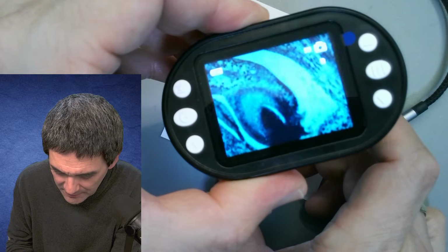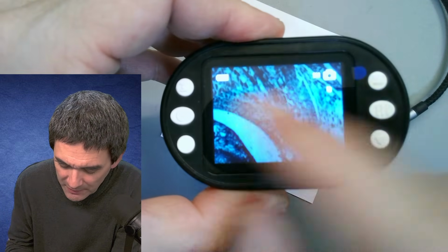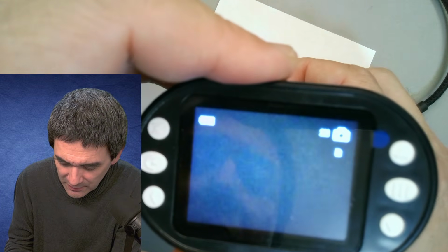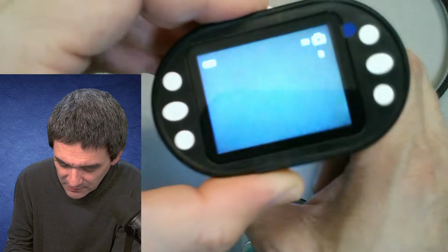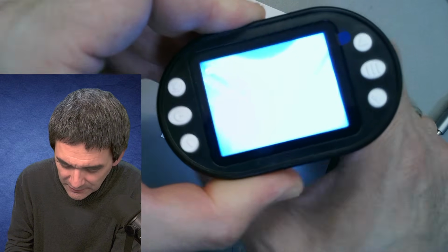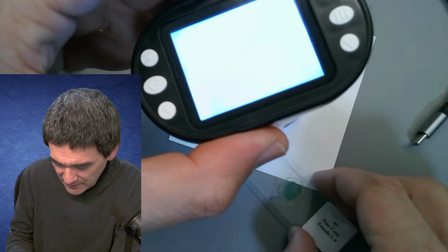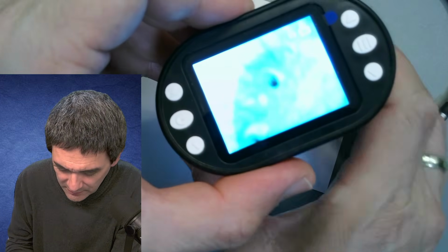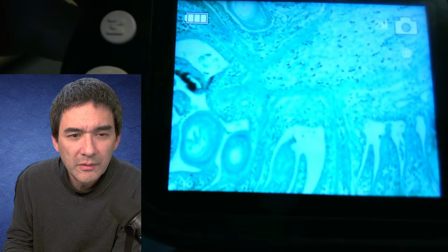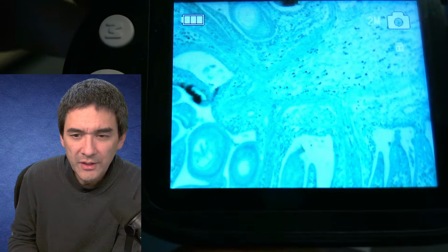So this is a little bit the problem that I have. You can see now it's in picture mode. I'm able to take pictures directly. Let's see if I'm able to go back here. Where's this? Let's put it here. Getting everything adjusted again. So it's a little bit, here we go. See, by focusing, everything is cramped together.